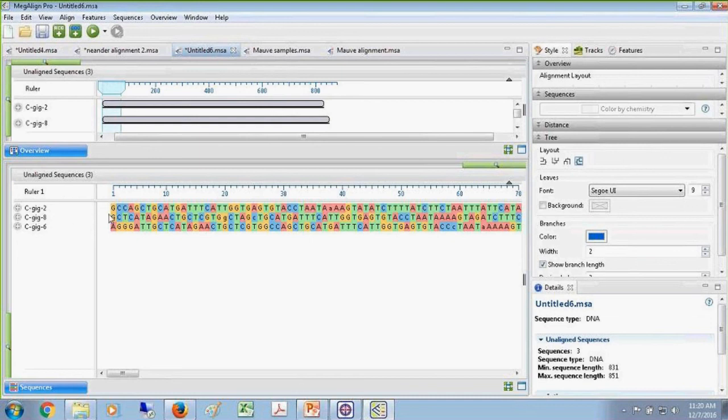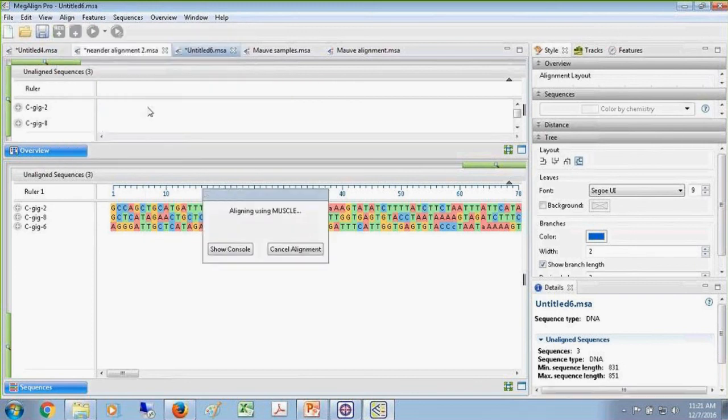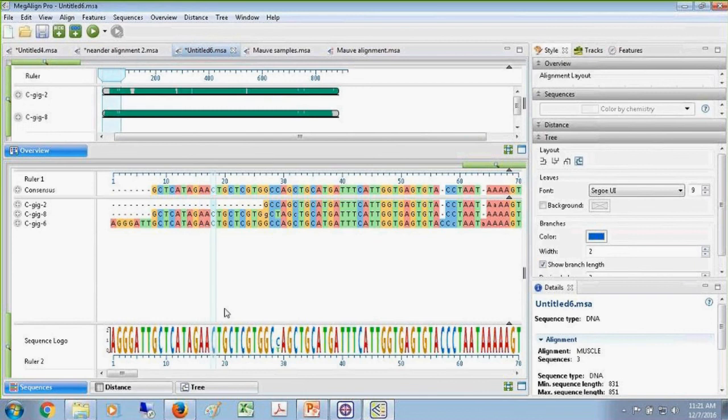So when I was looking at this kind of research, I didn't have any sequences to base what I was looking at off of. So what I was doing is I was cloning this PCR reaction and trying to identify the different donor species genome versions. So generally, I would have about 50 to 200 of these clones. Here, I just have 3 for simplicity's sake. I'm going to move up to Align. Just click MUSCLE. I intentionally chose 3 just so it's very rapid.